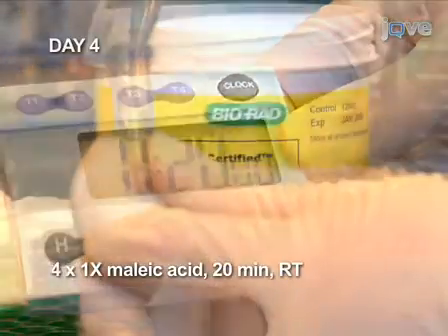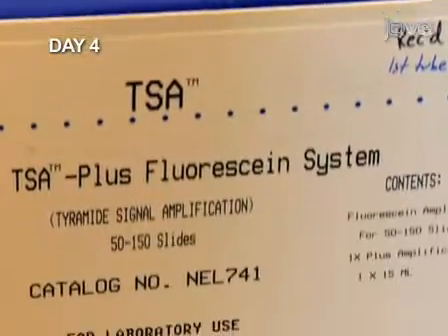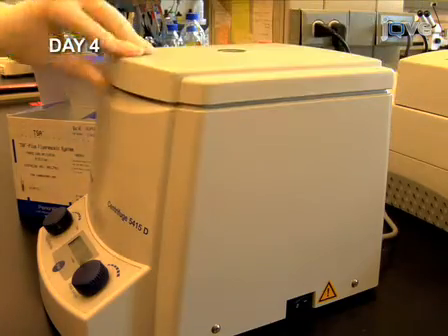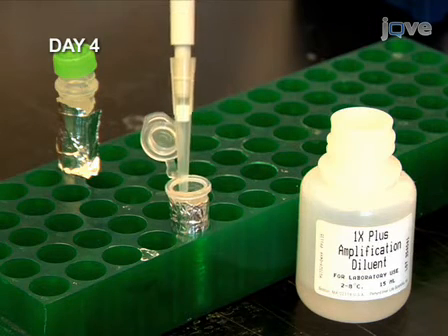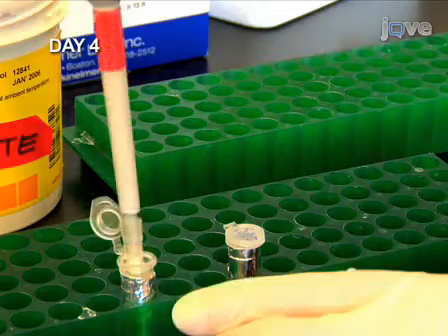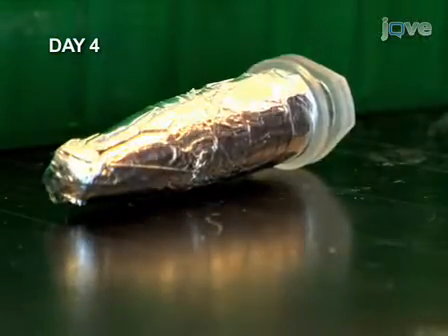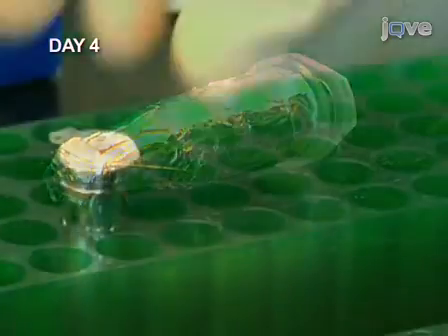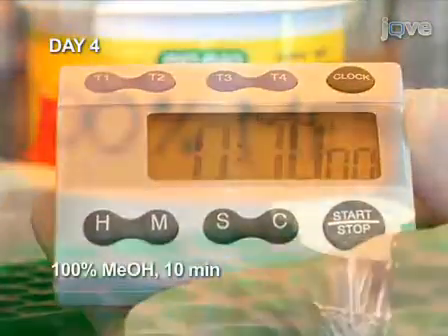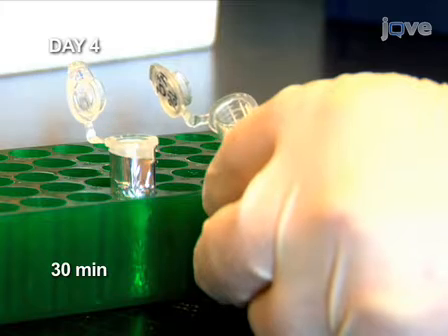Start with four 20-minute washes with 1x maleic acid buffer at room temperature, then wash twice in PBS. The fluorescein tyramide was previously dissolved in DMSO for storage; give this TSA substrate a quick spin down. Dilute the TSA substrate 1 to 50 in the amplification diluent buffer, add the solution to the embryos, and incubate for 45 minutes with the microcentrifuge tube on its side. Transfer the embryos through a series of 10-minute washes of increasing methanol concentration, with the last wash being 10 minutes in 100% methanol. Incubate for 30 minutes in a solution of 1% hydrogen peroxide to inactivate the peroxidase on the antibody.